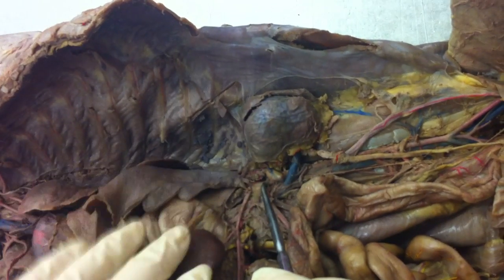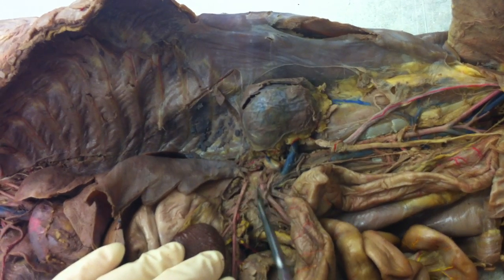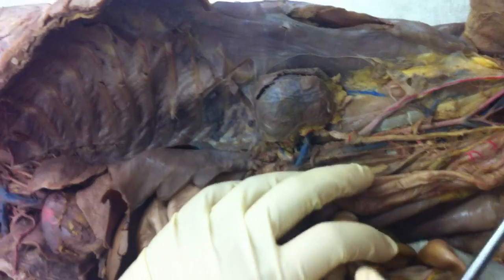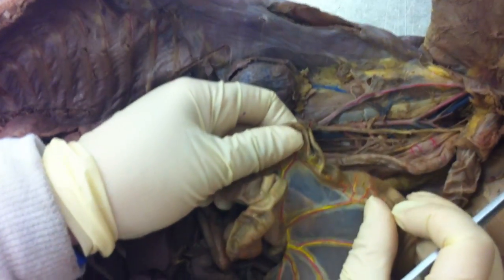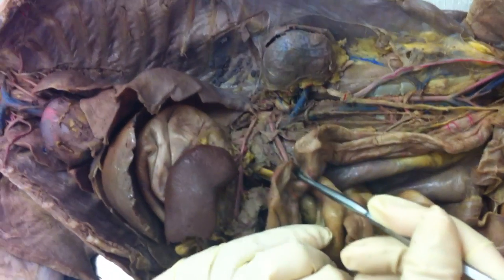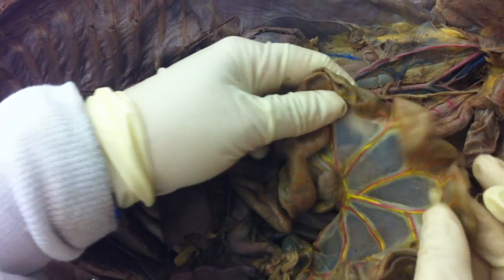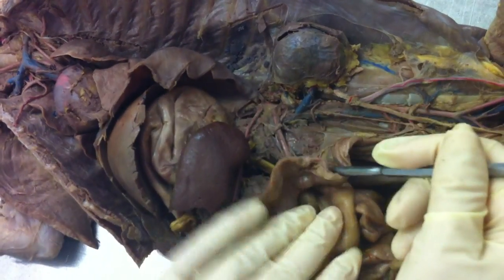Okay? Going back to our dorsal aorta, you come down. That next one that sort of runs parallel, this one is called the superior mesenteric. Do you guys remember what mesentery is? The tissue hanging out the stomach. It's all this stuff, right? All that clear stuff. So the superior mesenteric is the branch that gives rise to all of the intestinal arteries. So these are the intestinal ones, all embedded within the mesentery. So that's the superior mesenteric.